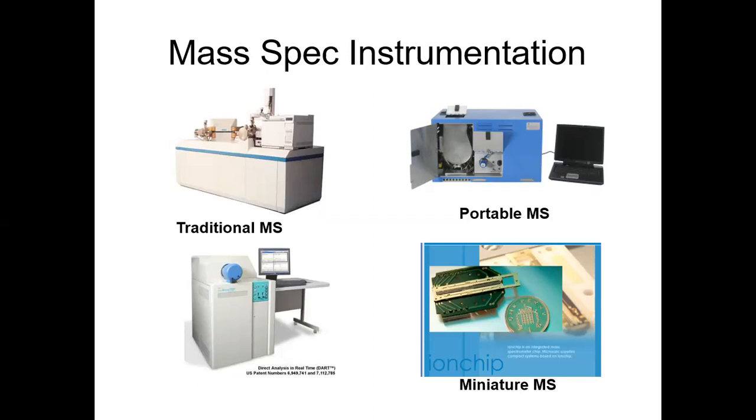I remember when it was a new idea. Let's put it that way. I'm old enough, I can say that. I'm old enough to remember when they had a conference dealing with miniaturized mass spec. How can we put the machinery, not necessarily the machinery, but just the conceptual part of a mass spectrometer? How can we get it down so small that it fits onto a chip? And now this technology is quite common.